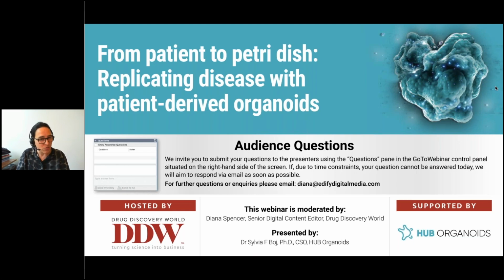So the data that I've shown you here is from a fibroblast primary line from tissue provided by a cellular provider. But now we are developing this. We are isolating these fibroblasts from the same tissue from which we established the organoids, and we have not tested it yet. But we will try to run the experiment with an autologous system of fibroblasts and organoids. Okay, thank you.